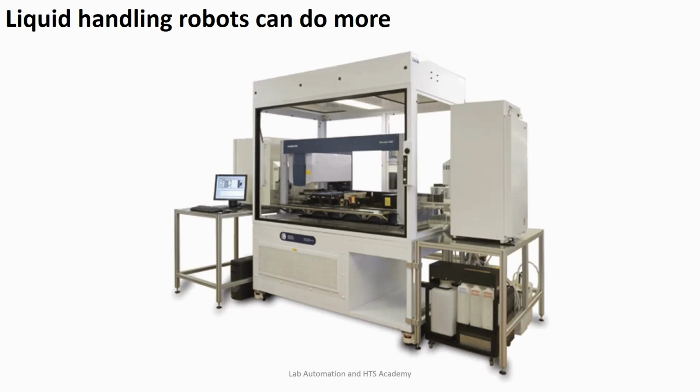So you can do the whole workflow from diluting your sample, transferring the samples, to wash the plate, to read the plate, all in one station. And that is actually what makes the liquid handling robots very important, because these days they are like the heart of the system, the heart of the automation workflow.